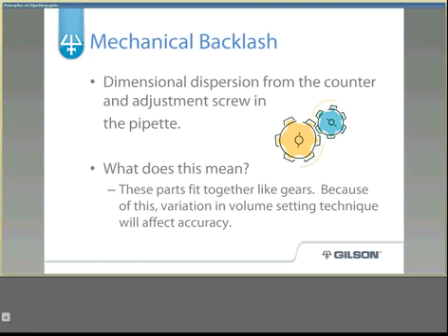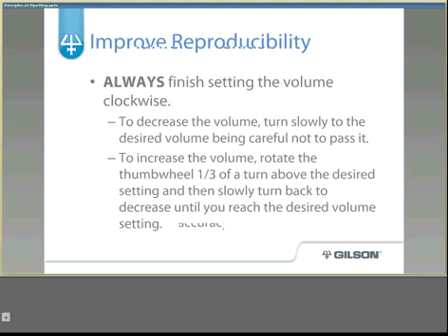Mechanical backlash is the dimensional dispersion from the counter and adjustment screw in the pipette. These parts fit together like gears, and variation in volume-setting technique will affect accuracy. To improve reproducibility, always finish setting the volume clockwise. To decrease the volume, turn the push button slowly to the desired volume without passing it. To increase the volume, rotate the thumb wheel one third of a turn above the desired setting, then slowly turn back to the desired volume, so that mechanical backlash always occurs in the same position.